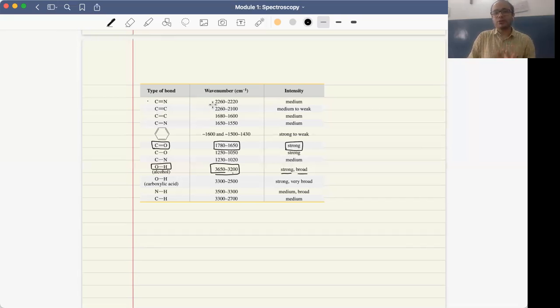This is very important because when we analyze compounds and the presence of functional groups, you should be able to easily find out what functional groups are present on the basis of the peaks you see in the infrared spectrum. So please write it down in your own handwriting and paste it on the table where you are studying, so that whenever you are solving any problem, it is handy to see the value and recognize the functional group present in the molecule.